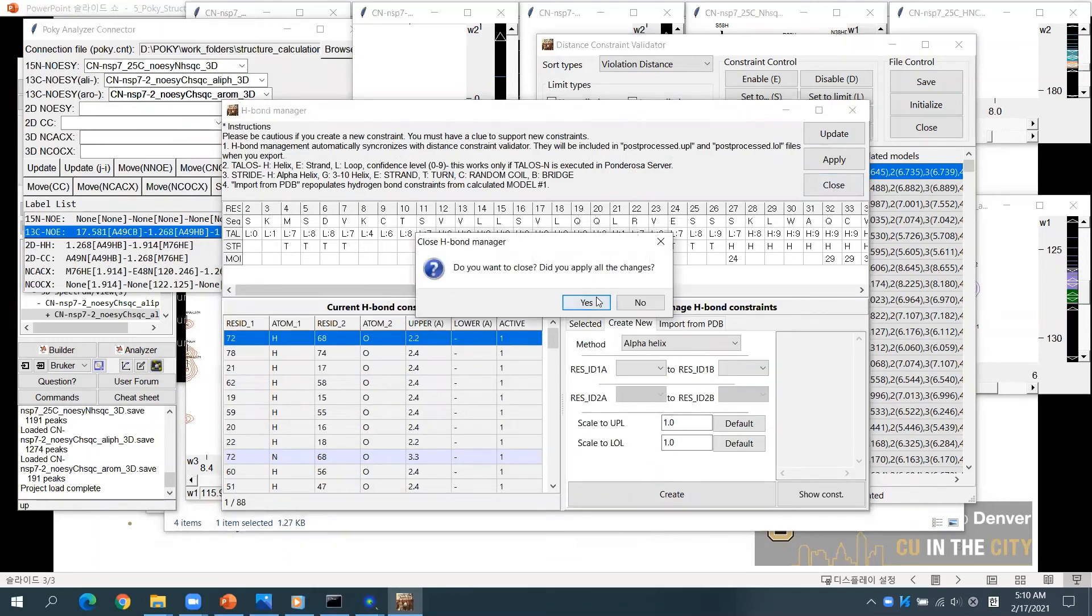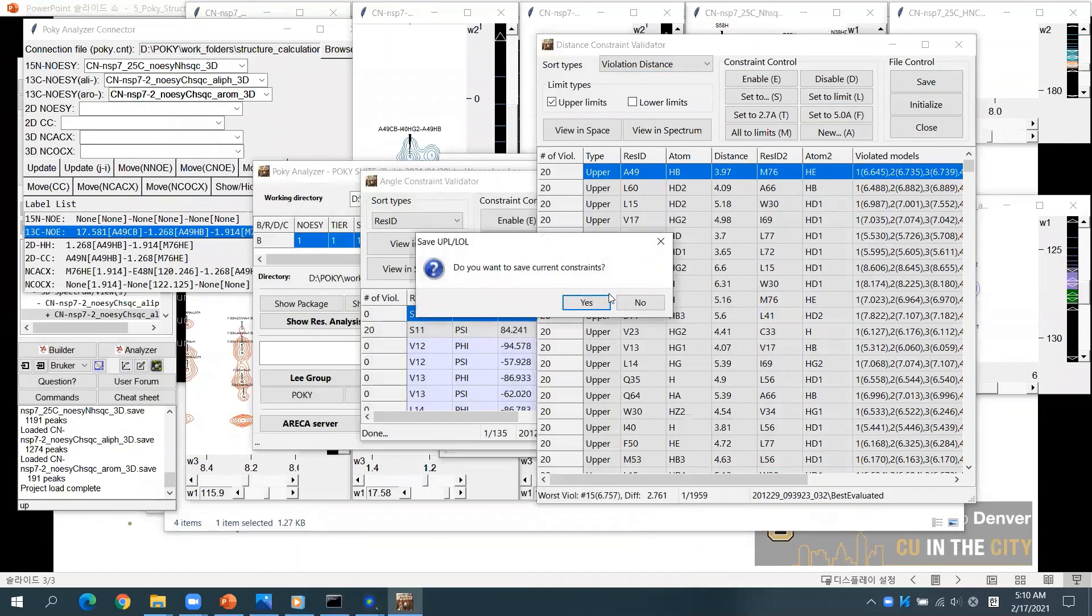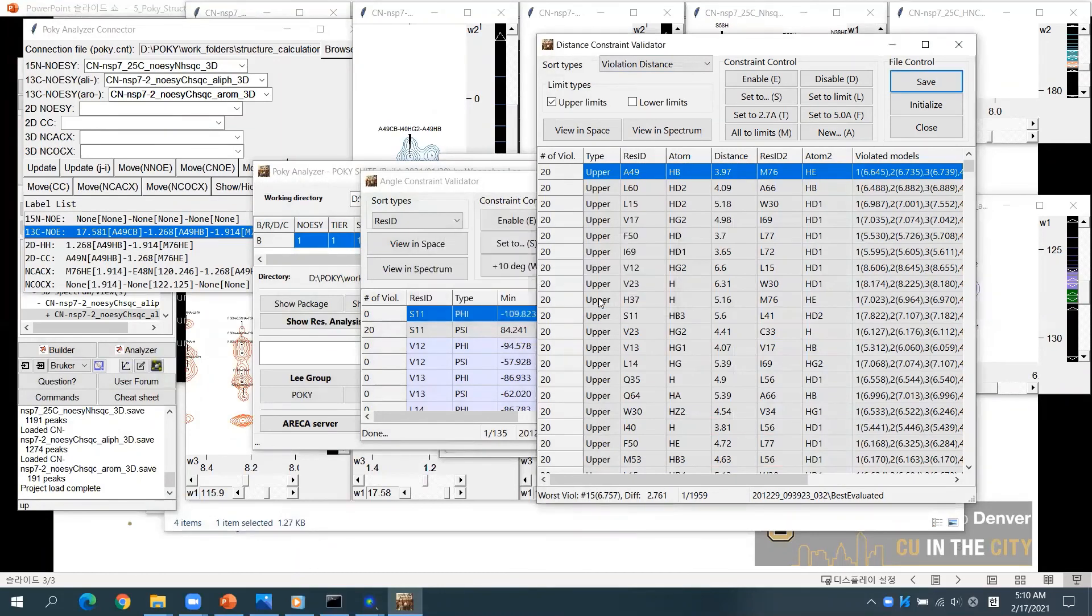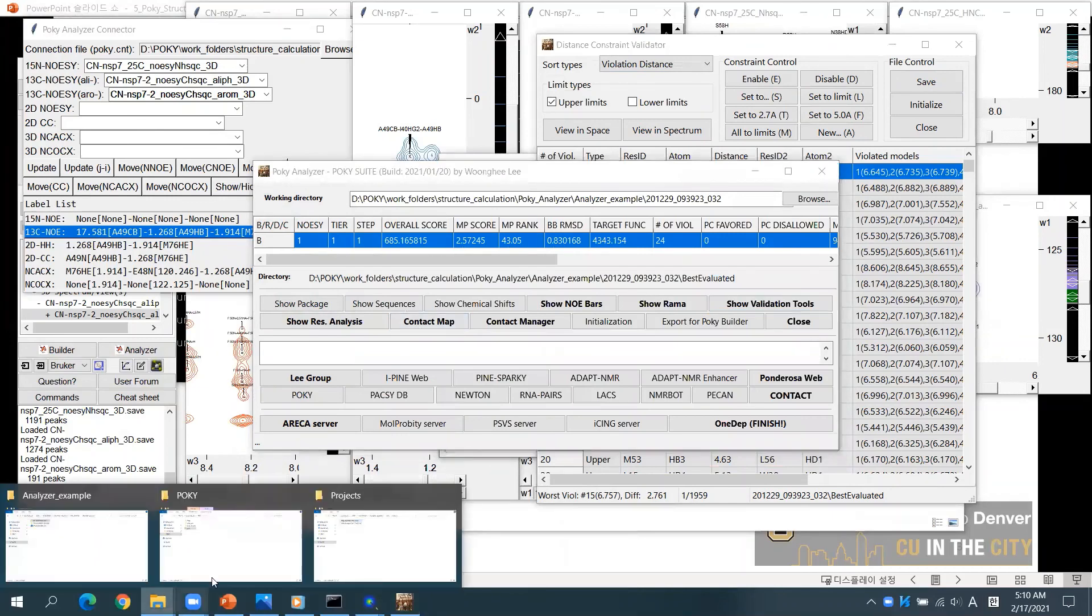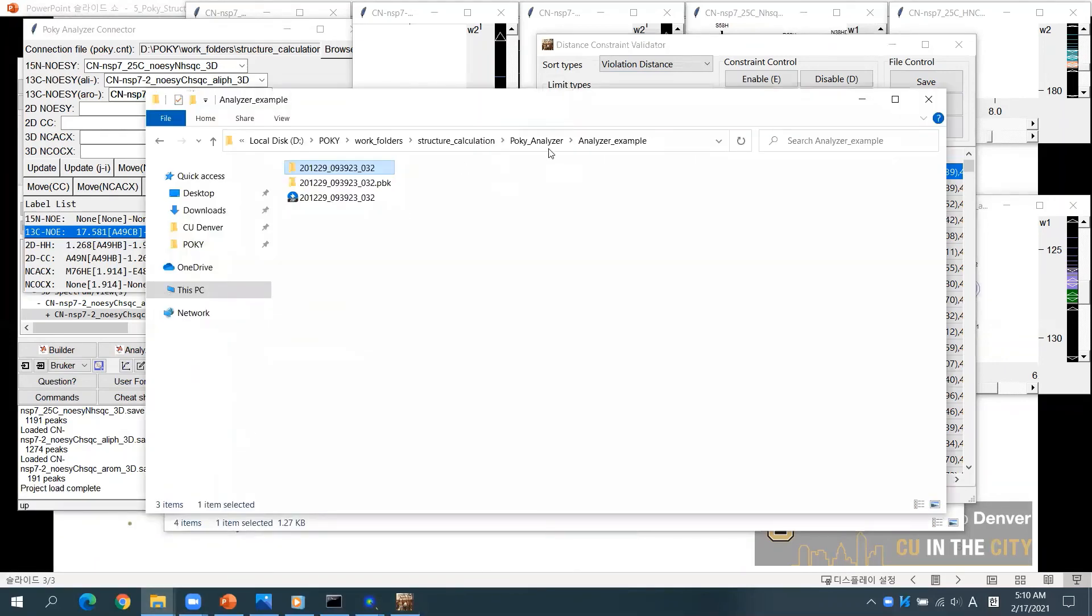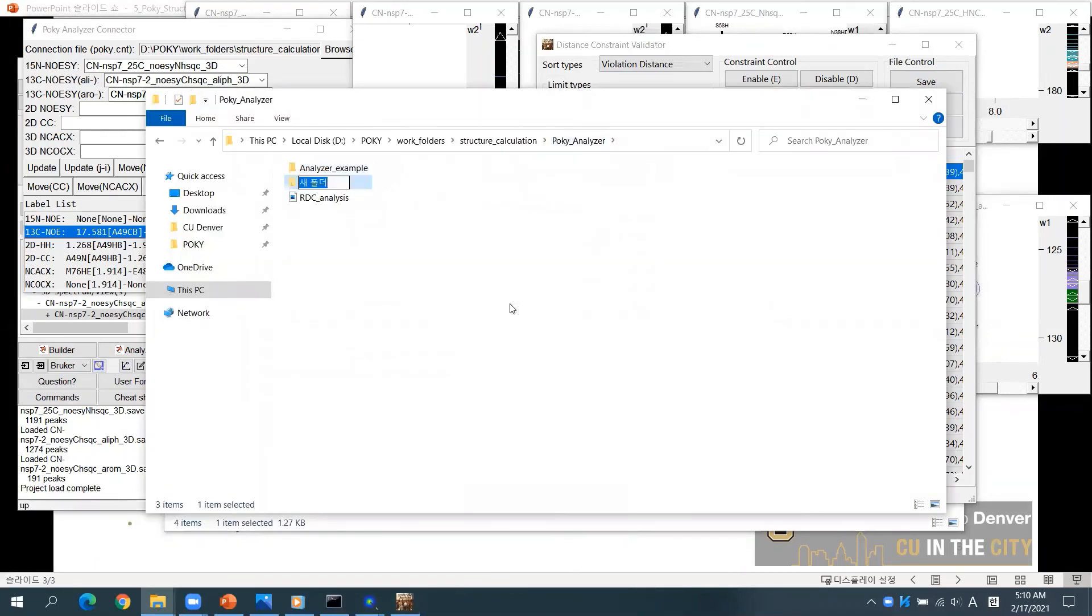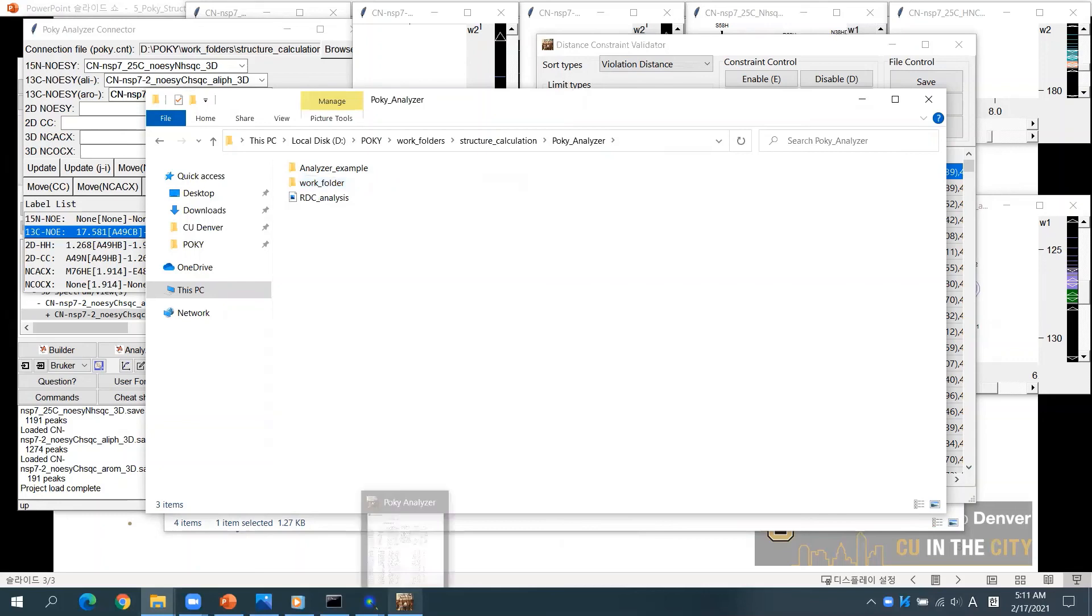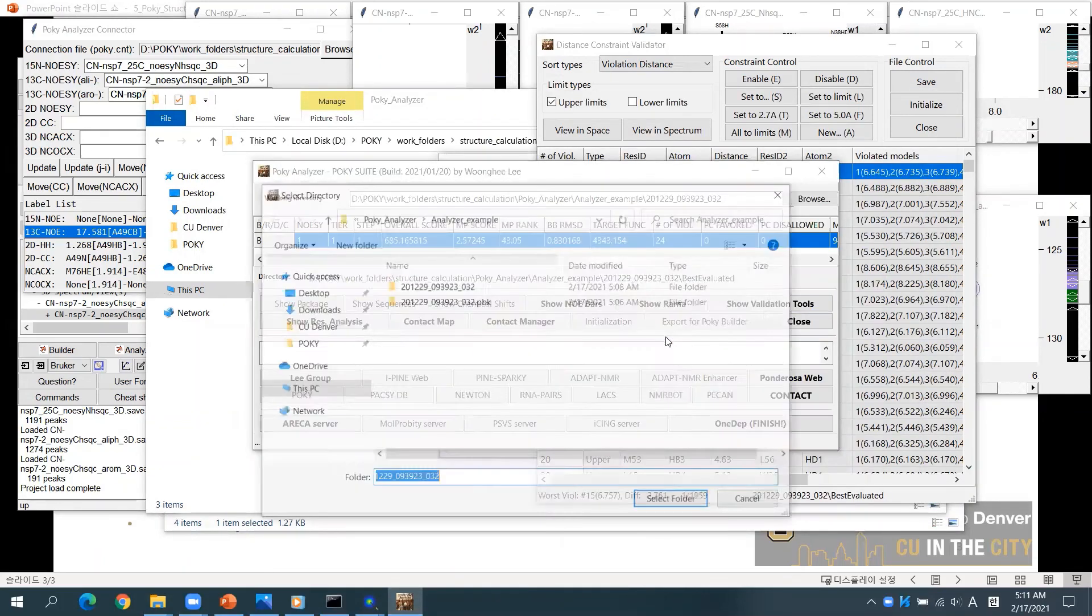Click Save to apply the changes. After completing your refinements, create a work folder. You can export the refined restraints by clicking Export for Poki Builder.